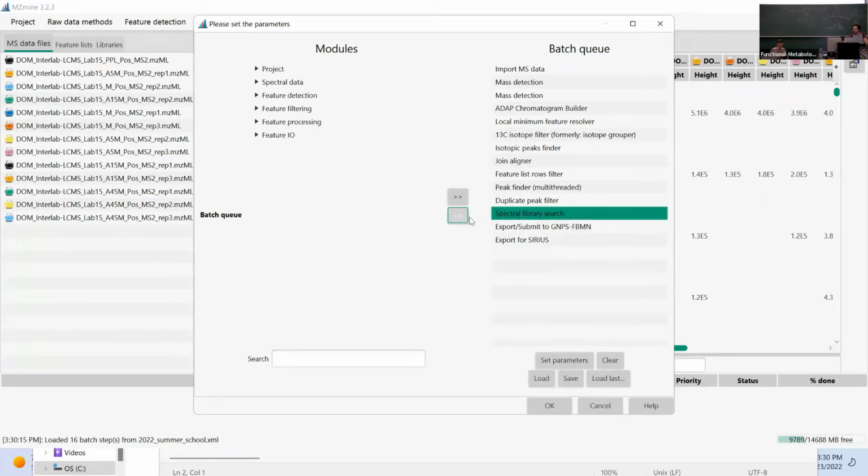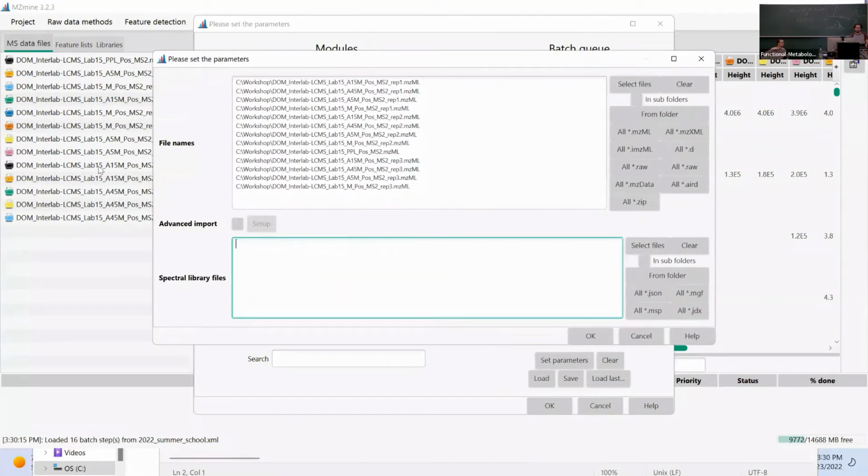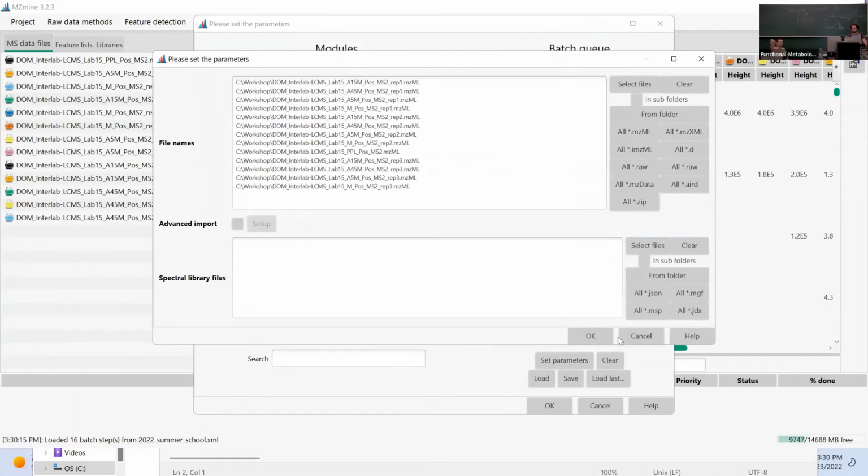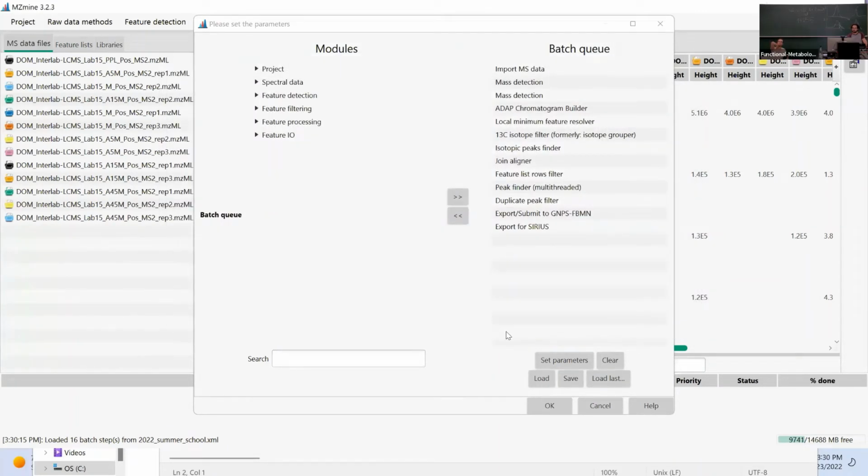I would give the mass detection thresholds a little check, because even though this is all Orbitrap data, within the data sets we selected, there might be some tiny differences between the different platforms. And that's actually also what I already saw. Some people were like, but wait a minute, it doesn't look like for your data set. And it's the task later on that it's a similar platform.